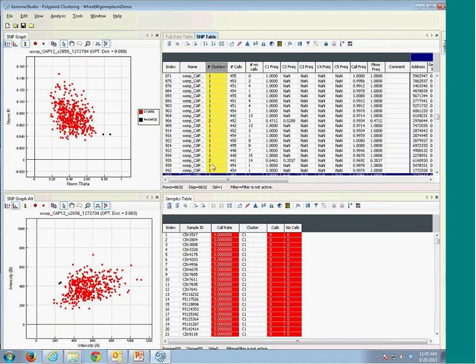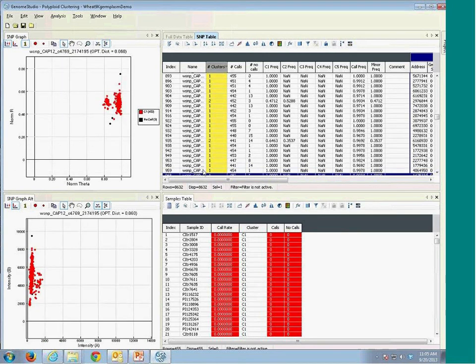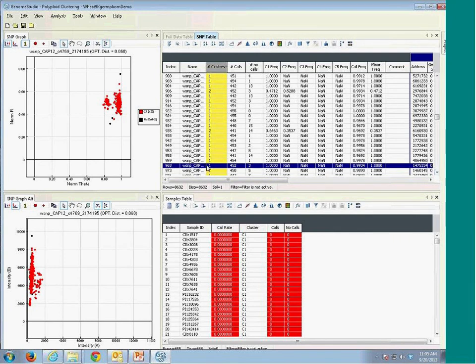So this new PC module actually is quite helpful compared with the genotyping module, because in the genotyping module we have to actually go in and assign the samples, assign the cluster that was shifted. And in this new PC module, you don't have to do much, and the editing is pretty easy, and there are a lot of shortcuts. You can just hit a key on the keyboard and do the clustering. So this is in a nutshell how I do the clustering and also edit the clusters.